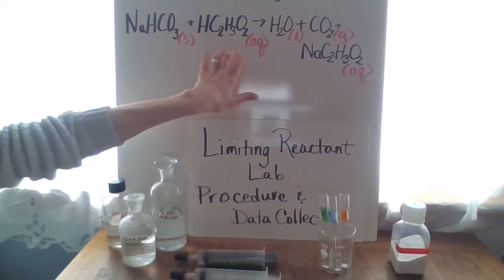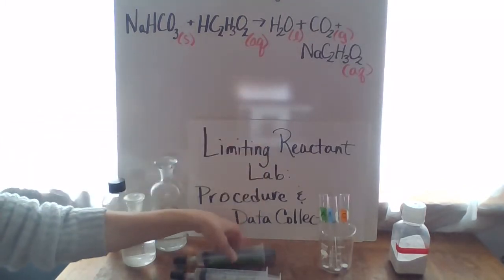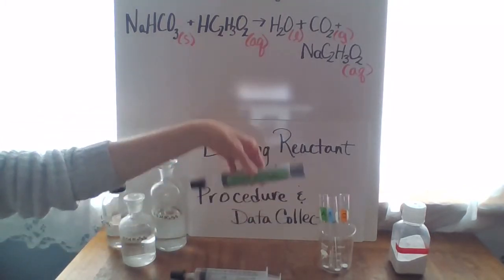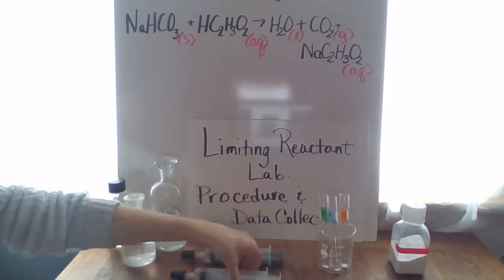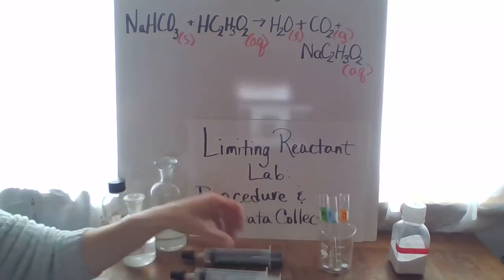We are using acetic acid and I've drawn up into syringes 5.0 milliliters of the 0.20 molar, 0.40 molar, and 0.60 molar.